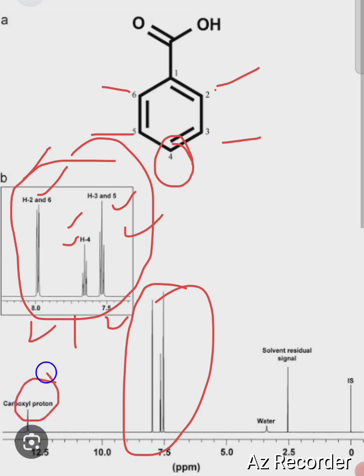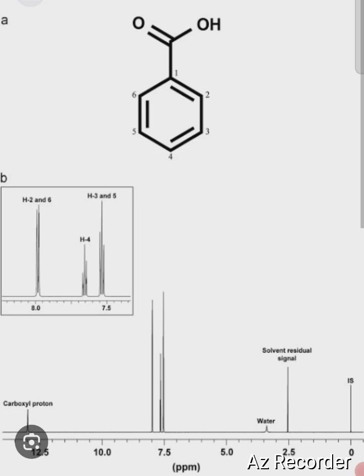Lastly, if you see here, there is a peak for the carboxylic acid, which confirms the benzoic acid NMR.